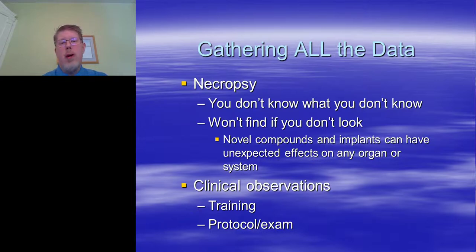And when you do a post-euthanasia necropsy and you find that the kidneys are 4 times larger than they should be, or their heart is dramatically distended in the atria, was that what you expected? No. Was it an organ system that you were looking at? Still no. Is it something that you probably want to know as part of the discovery team about probable complications? Absolutely. So you have to look for these things.